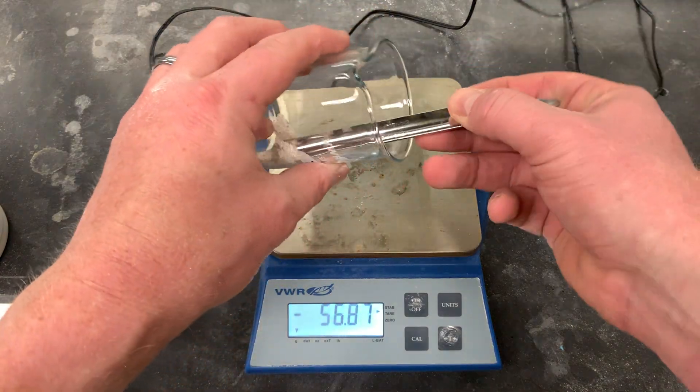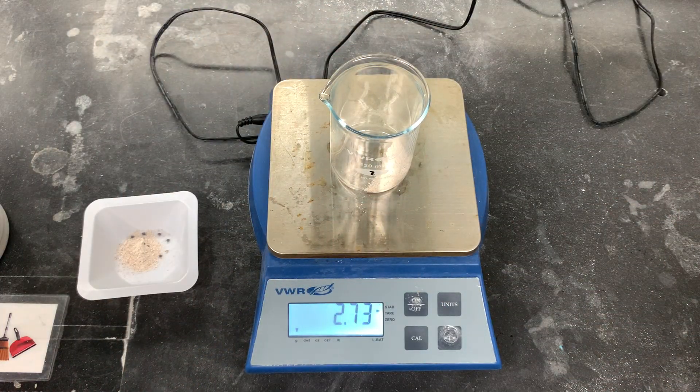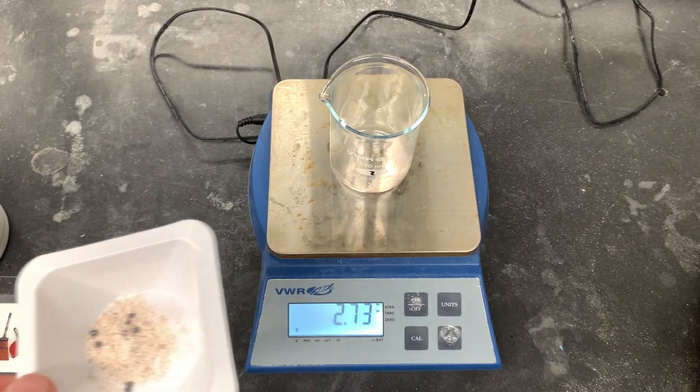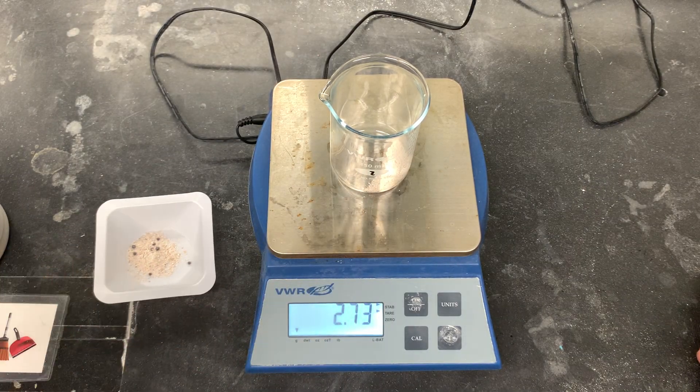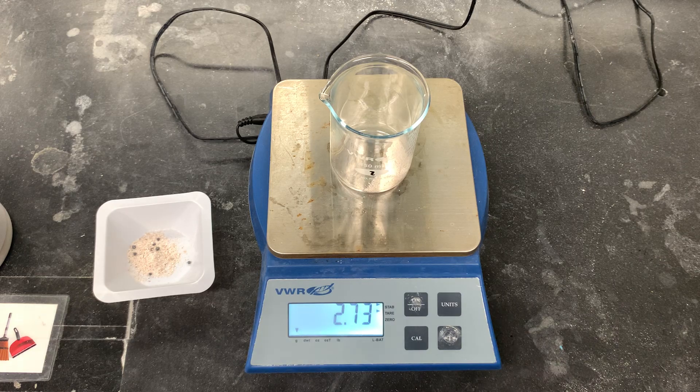I've got 3.62 — get a little bit less — and 2.73. That's a good stopping point. This excess, I'm going to take it to the solid waste container and dispose of it there, because I don't want to put it back into the unknown stock since I would have already contaminated that.